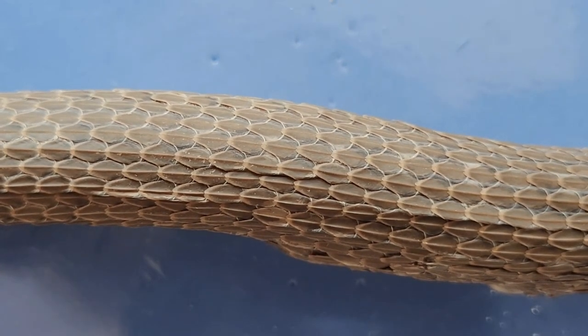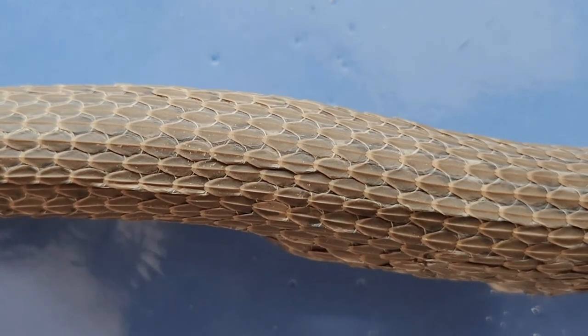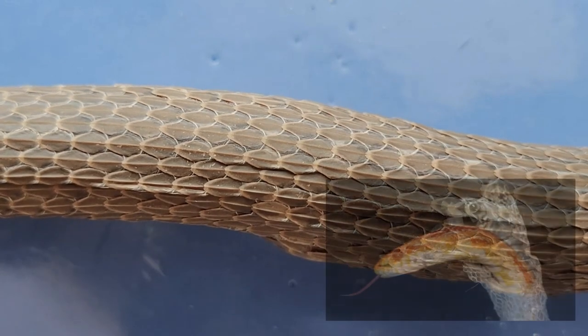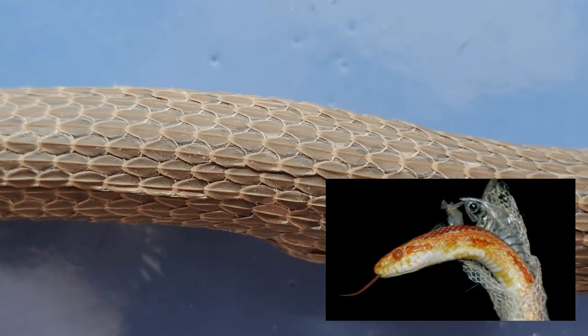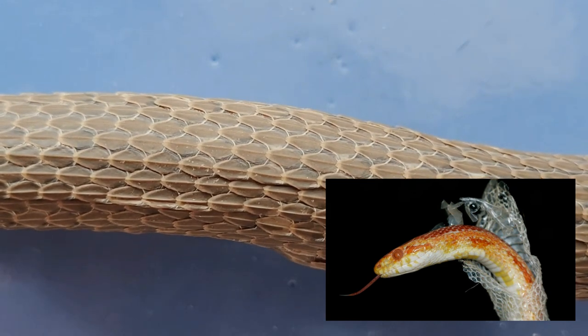Snakes also shed their skin when they outgrow it, multiple times a year. What's actually somewhat unique among snakes is that they shed all of their skin in one piece, like peeling off a sock, while other reptiles usually shed their skin piece by piece.